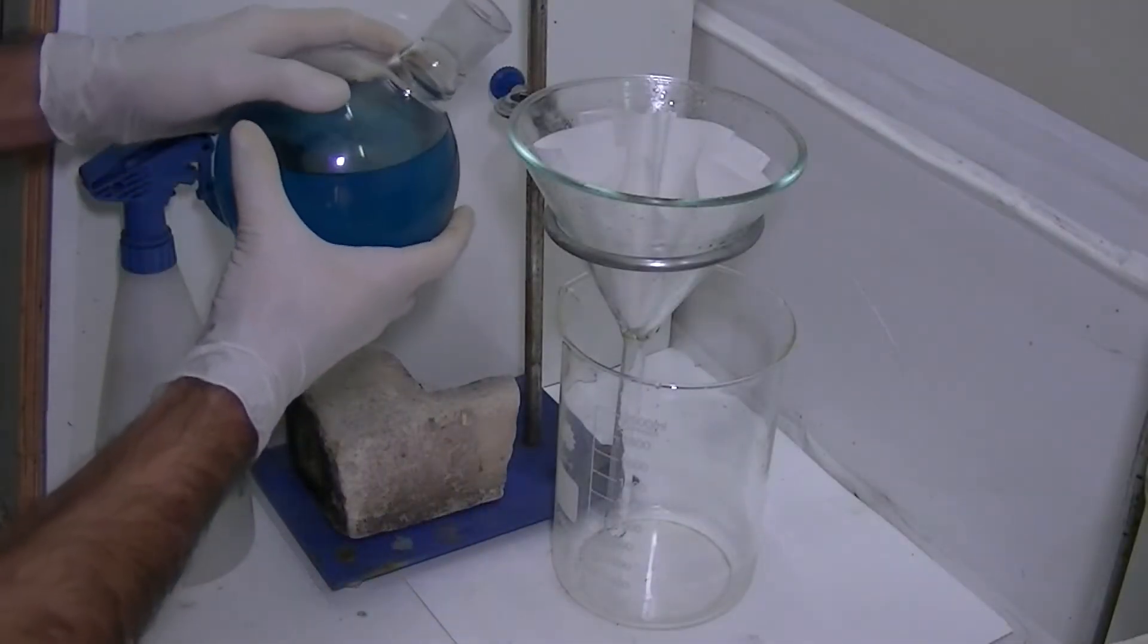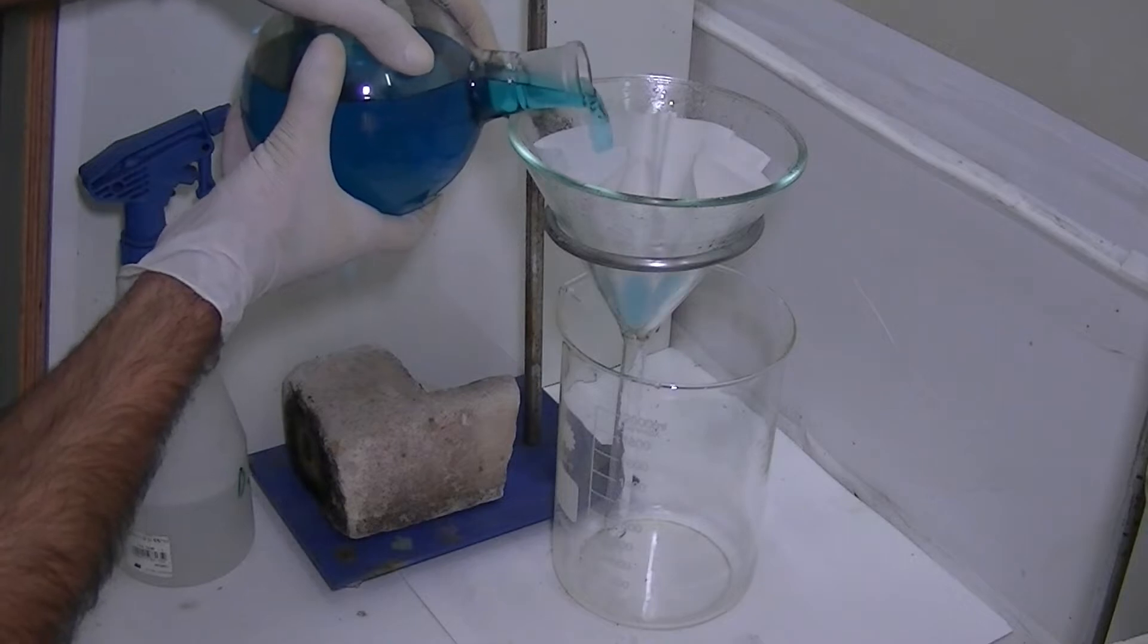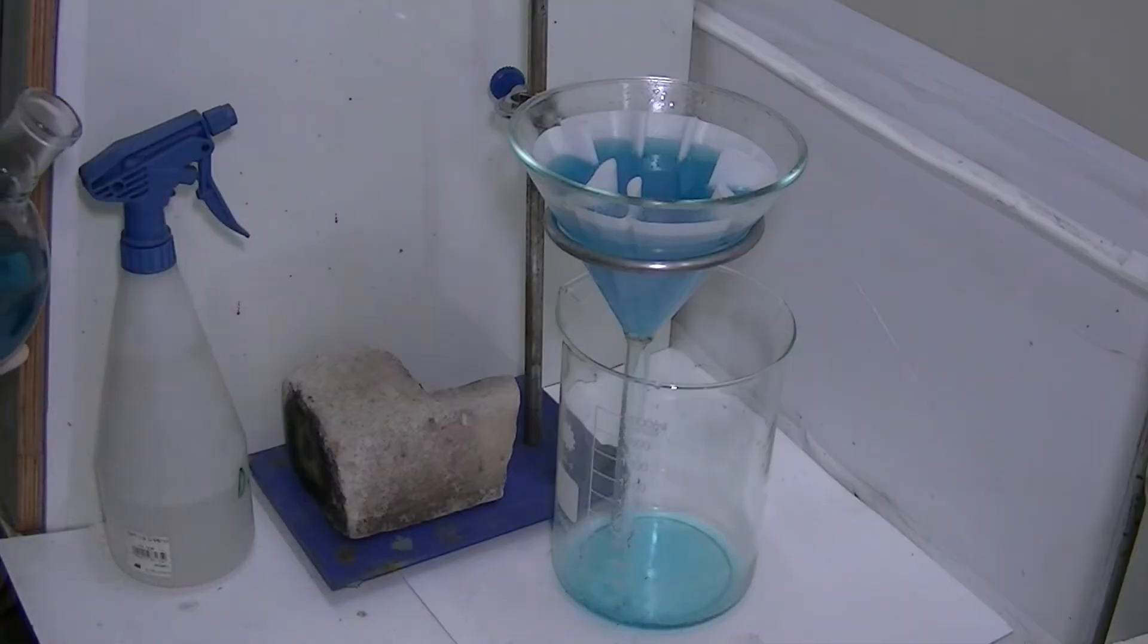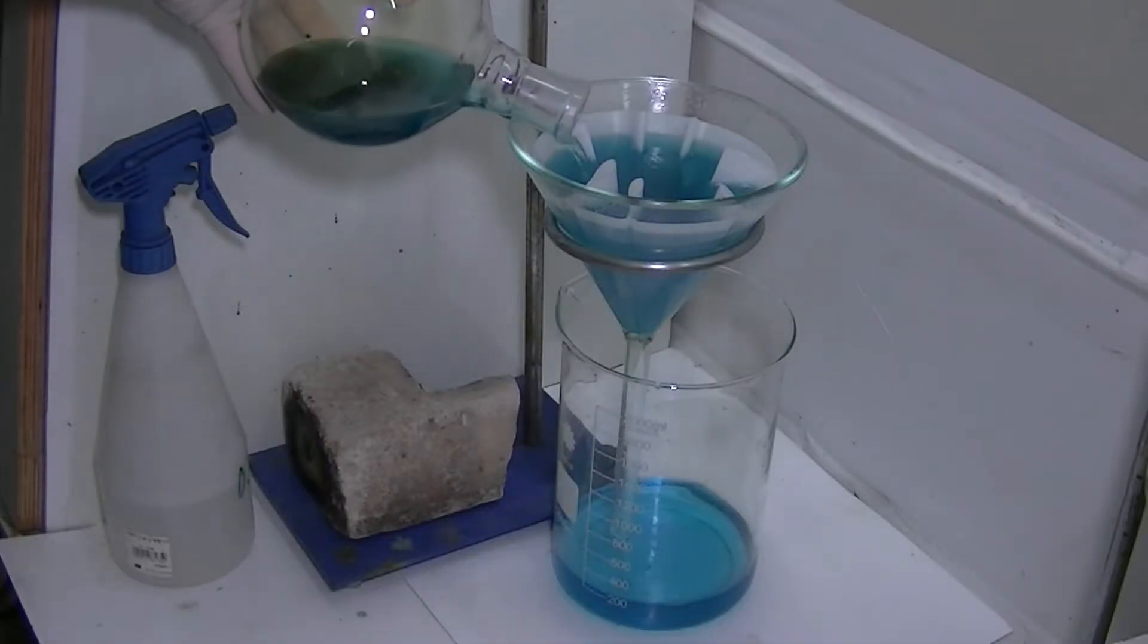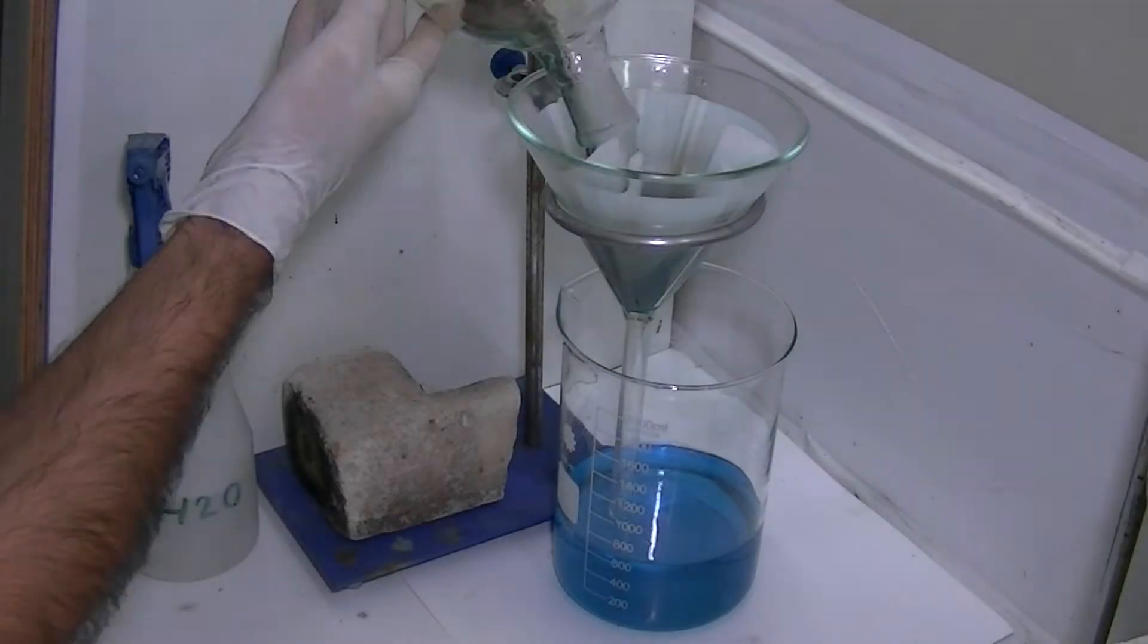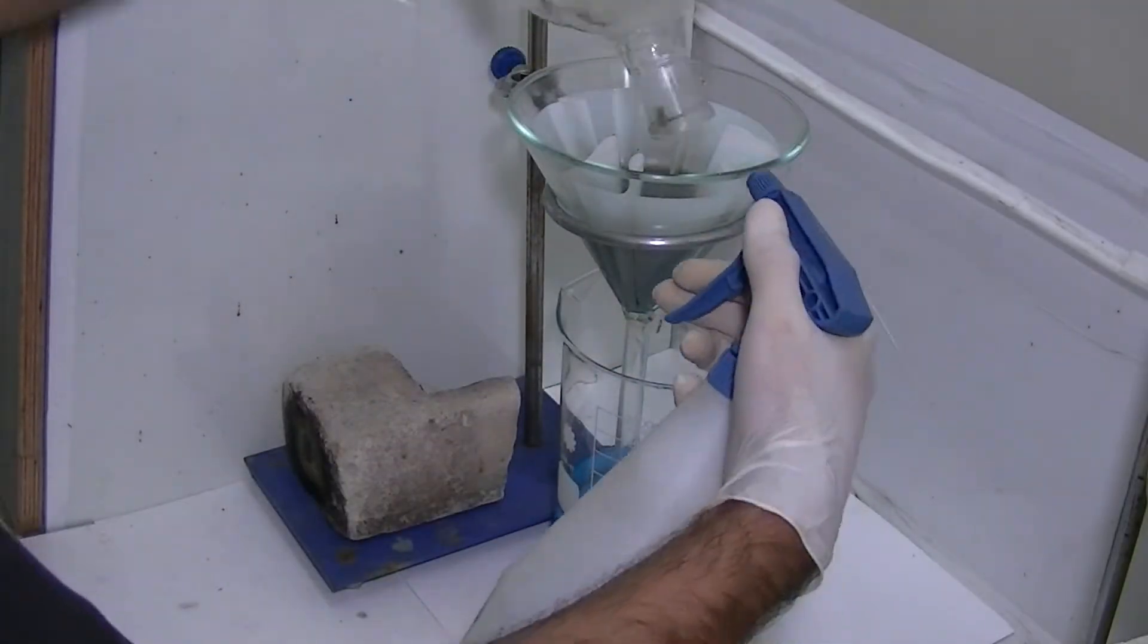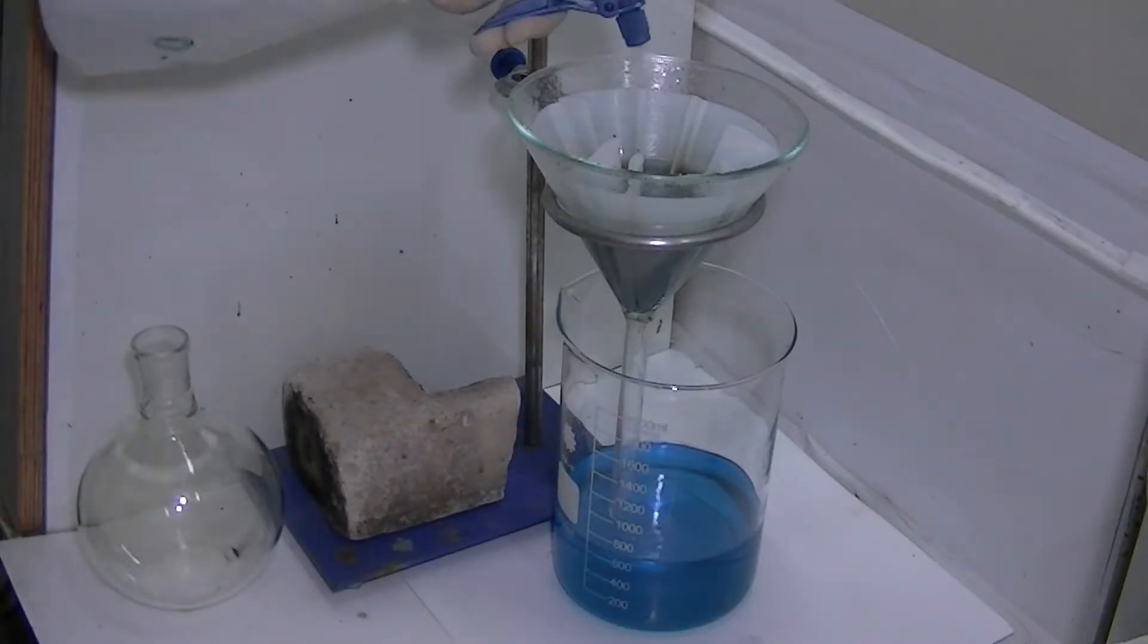First, only the supernatant is filtered as it is free of solid particles and will run down the filter very fast. Once the supernatant has passed through the filter, the sludge is drained and washed several times with distilled water to collect every drop of silver solution.